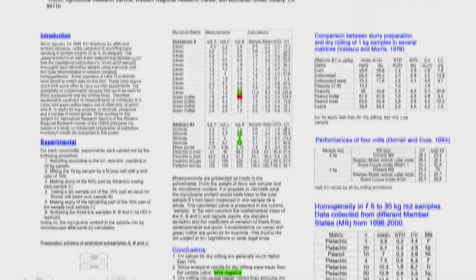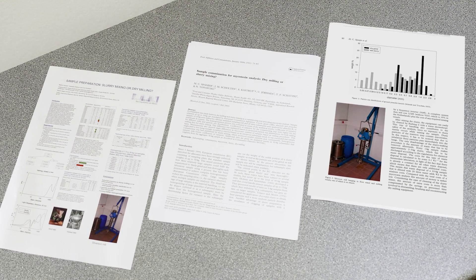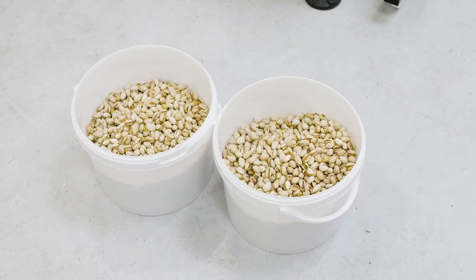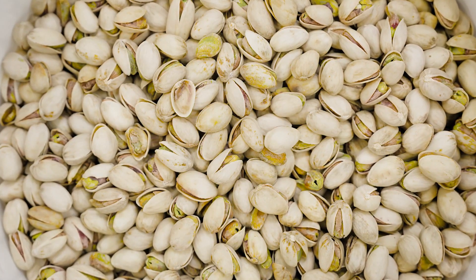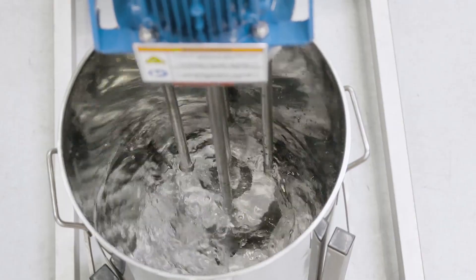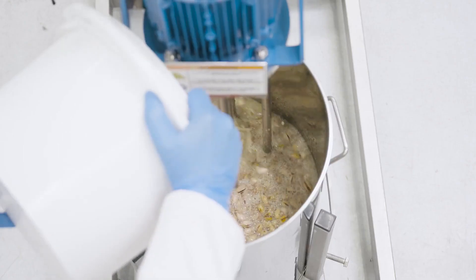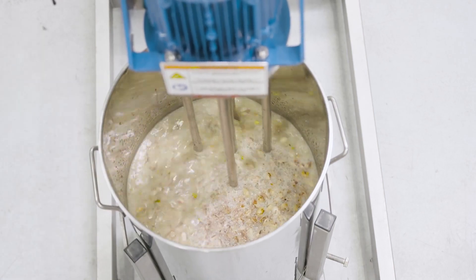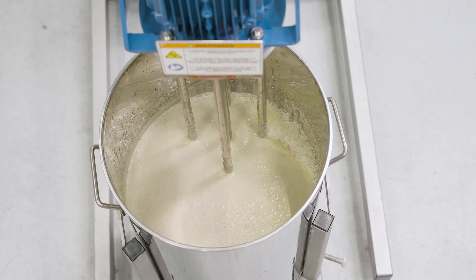Silverson high shear mixers have been used for this research and they are now specified as standard equipment for sample preparation in several countries. Typically the sample — in this demonstration pistachio nuts — is mixed at a 50-50 ratio with water. The high shear action of the mixer will rapidly disintegrate the nuts and form a homogeneous slurry with a fine uniform particle size.